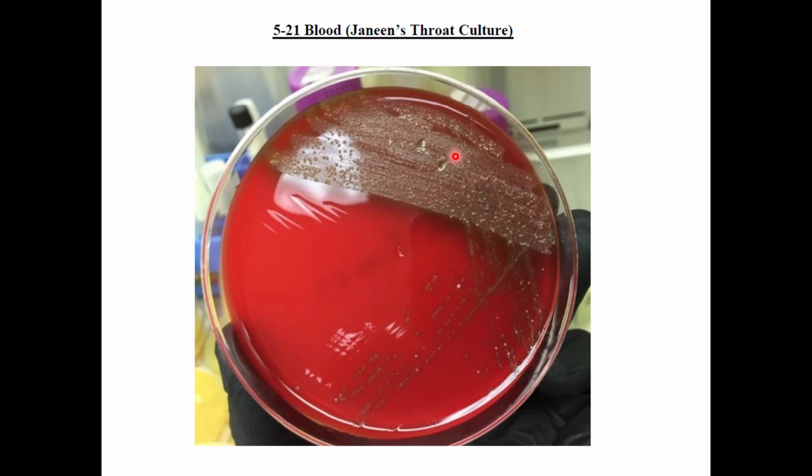So you'd kind of push down the bacteria with the loop, and then the bacteria that grow under the surface could perhaps break down and destroy the red blood cells more than they would on the surface, because if they are streptococci, they could have streptolysins. So they're more specialized enzymes that work better in anaerobic conditions.